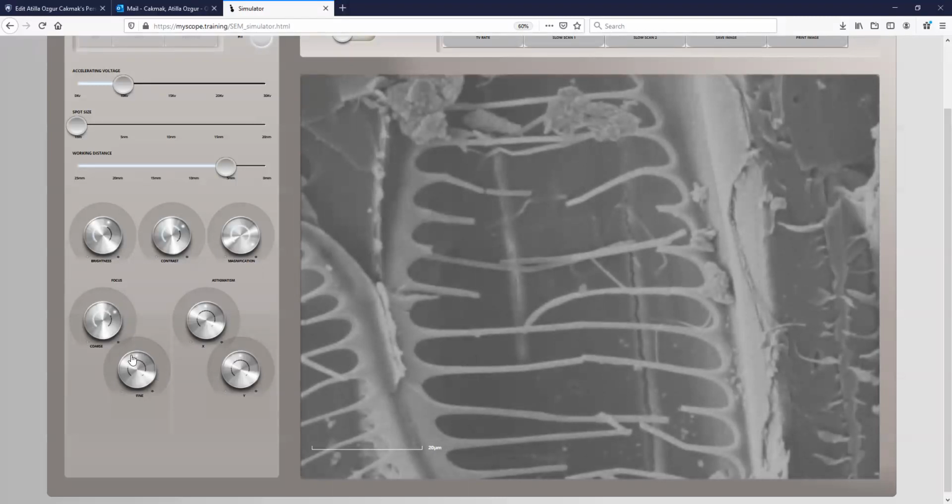And that's the coarse focusing, so you can start to do the fine tuning by adjusting the fine focusing knob as much as you can. And the students will appreciate that. Okay, so there's a sweet spot of focusing or these readjustments by moving around the knobs, and then they will have to figure that out.